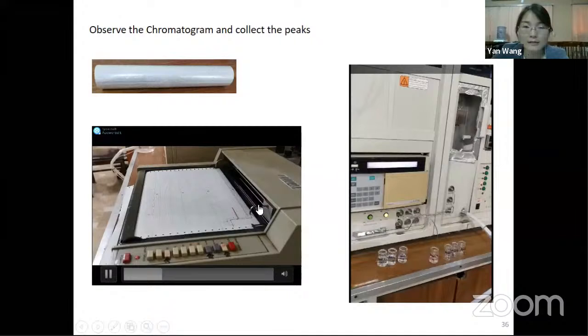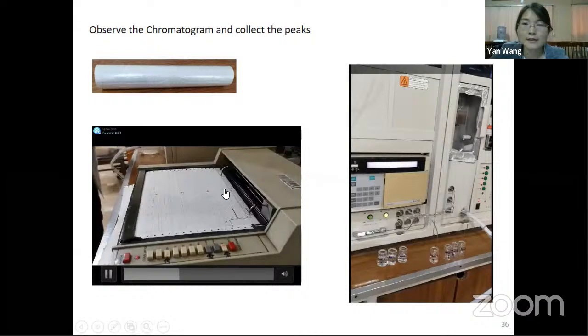But for II, it starts slowly and gradually. Why? Because the sensitivity of the two detectors for this compound is different. It's UV positive at this wavelength. The UV can give a big value. And usually the RI detector is not as sensitive as UV, but we can still see a peak. So both of the detectors have given us a beautiful peak.